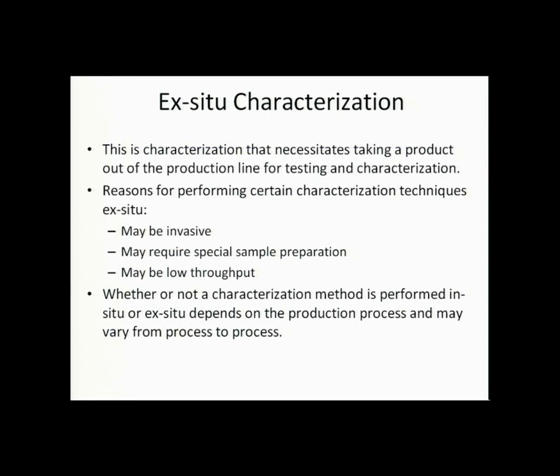So that was in-situ characterization. Now let's talk about ex-situ characterization. So ex, now we're outside. Okay, this is characterization that necessitates taking a product out of the production line for testing and characterization.